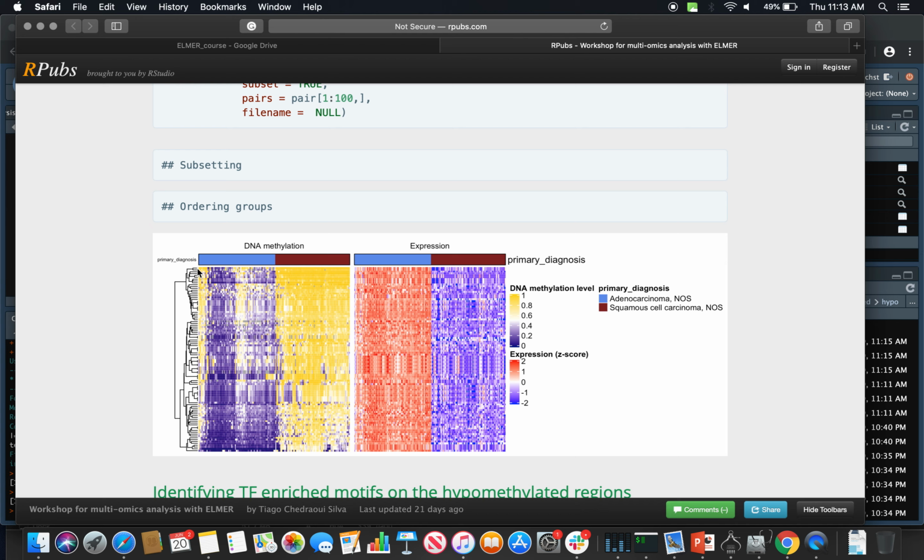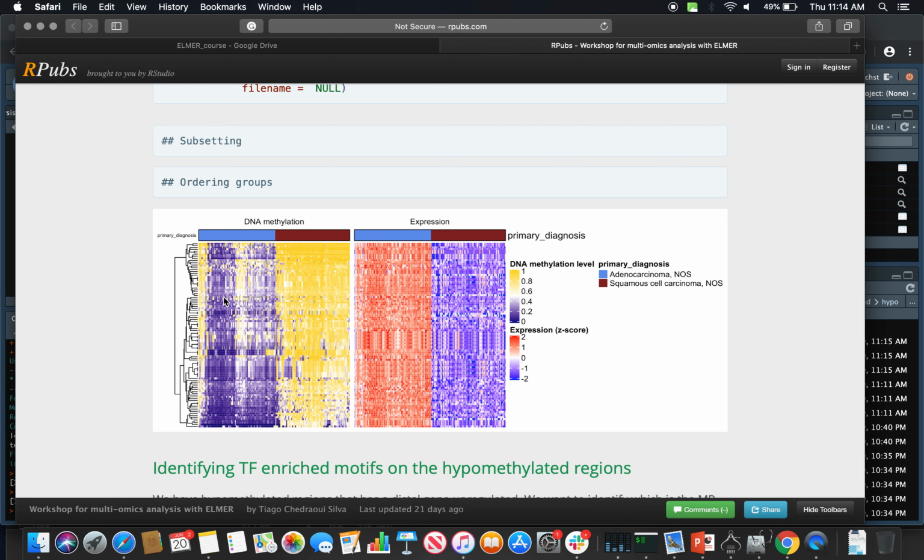So we are looking for hypomethylated samples in adenocarcinoma. So adenocarcinoma is light blue, and the gene are upregulated, while the squamous is hypermethylated and the gene is downregulated. So this is anticorrelation. Yeah. So blue means hypo, yellow means close to one's hyper, and the z-score, and then the expression is mainly z-score. The z-score is actually the value centered. So you get the median value and set to 0, and then all the other values are going to be the distance between that center.